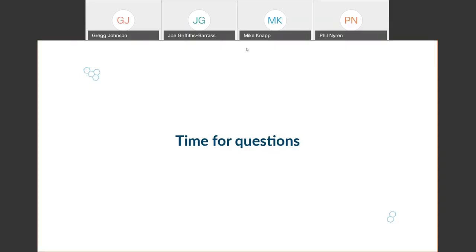Thanks, Phil. The next question, would you recommend peristaltic pumps for a long-term perfusion culture with high cross-flow rates that go over 60 days?